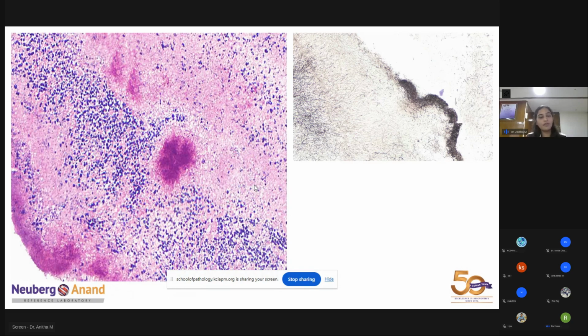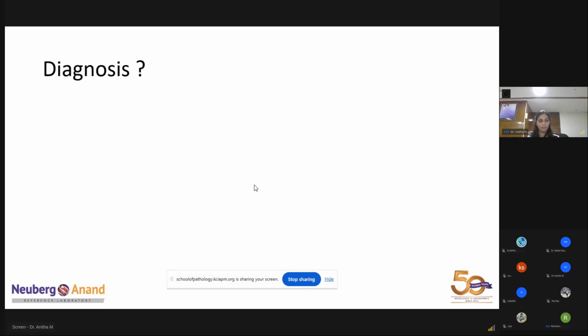How can we differentiate this from nocardiosis? There is a modified acid-fast stain in which we use 1% sulfuric acid. That is negative for actinomycosis and positive in nocardiosis. So that is the main differentiating point between these two. Okay, thank you.